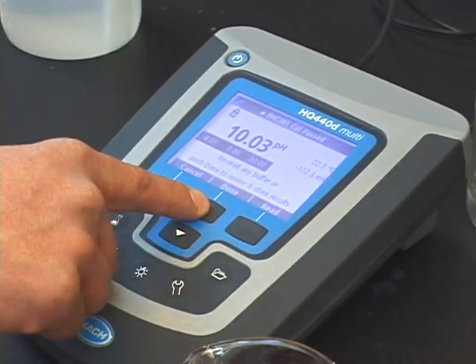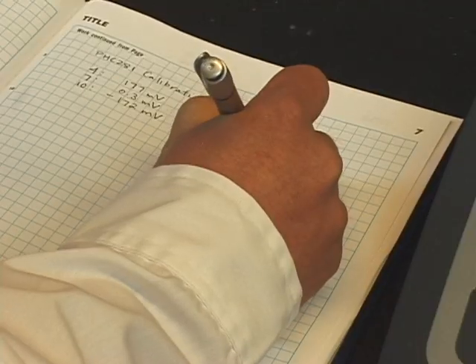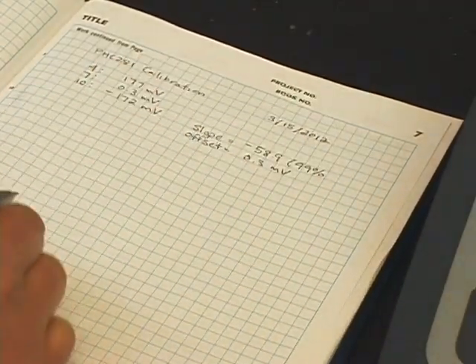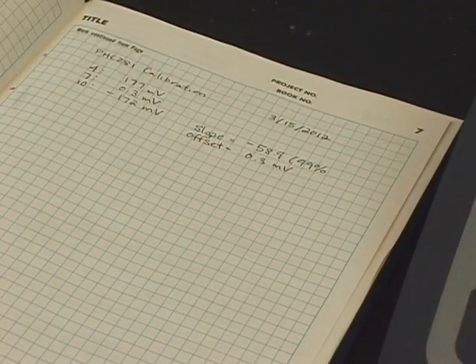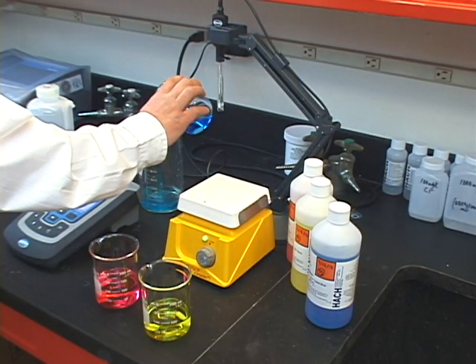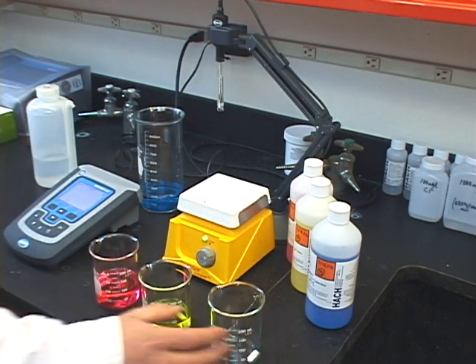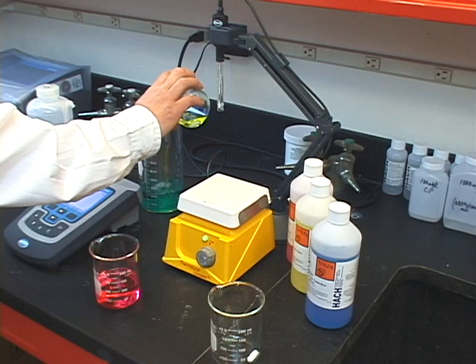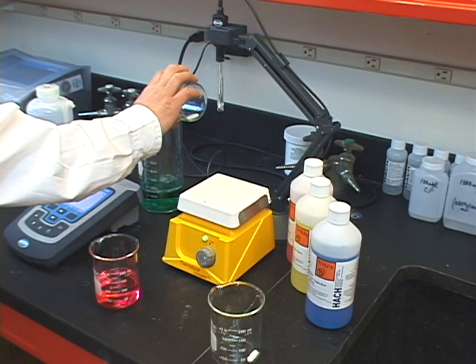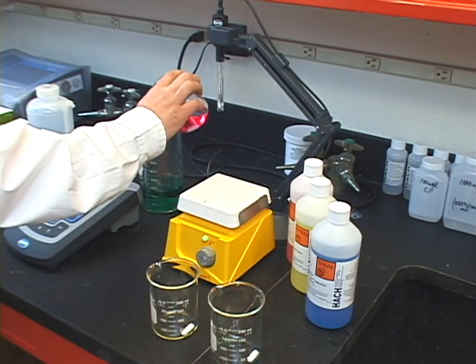Once you have all of your calibration readings, you can record the slope, time, and temperature of the sequence. When you're finished, do not pour used buffer back into the original container, as this will contaminate your buffer solution. Each time you need to calibrate, new buffers should be used. Remember, buffers are inexpensive, but errors introduced to your measurement are not.